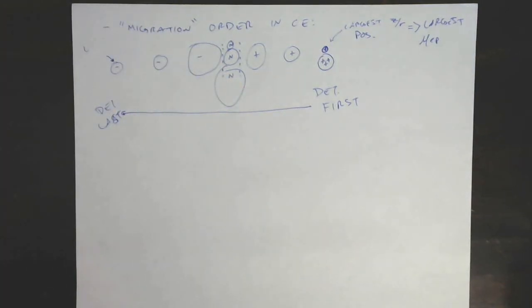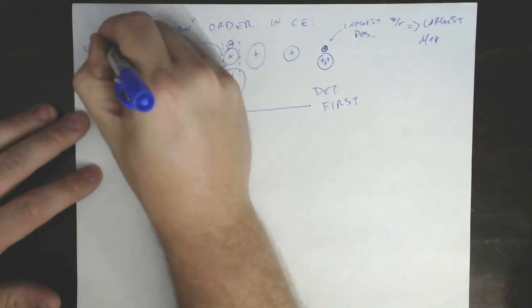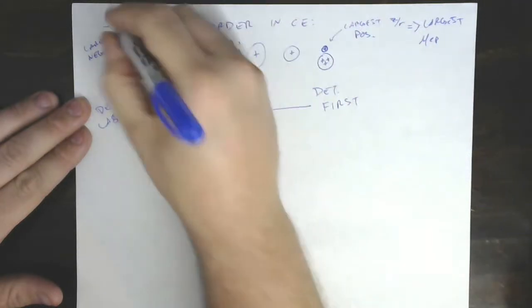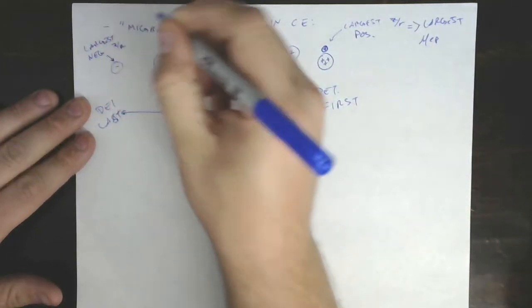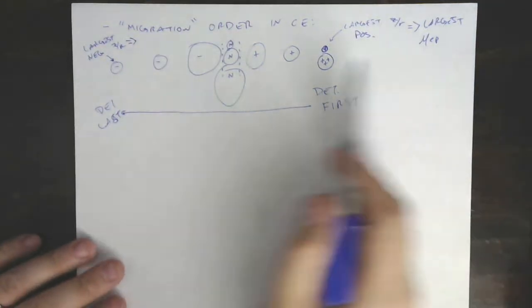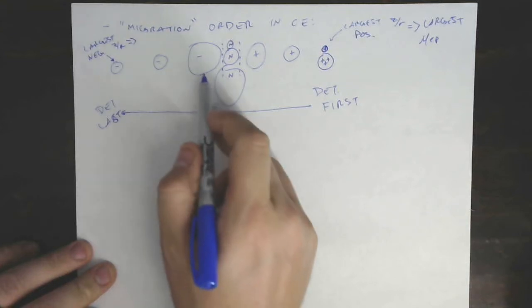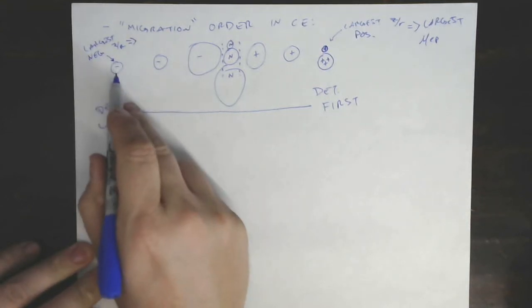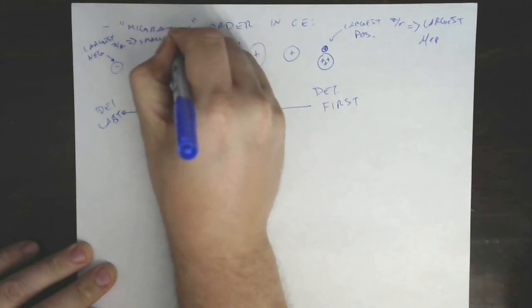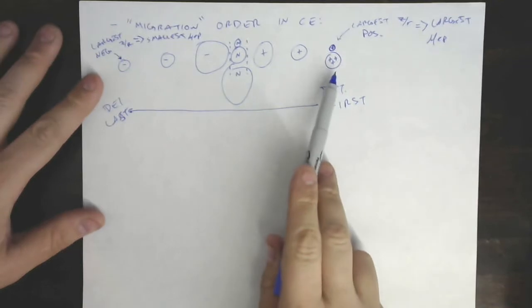This is the largest negative z over r, and therefore let's just really call this what this is. A big negative number is actually a small number, right? A small negative number is a larger number than a big negative number. So this is actually the smallest mu EP.